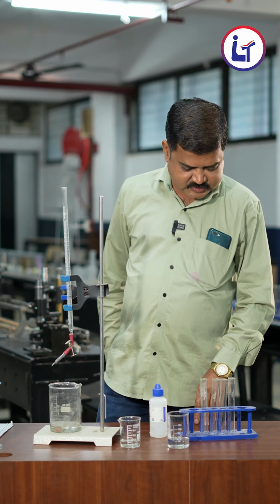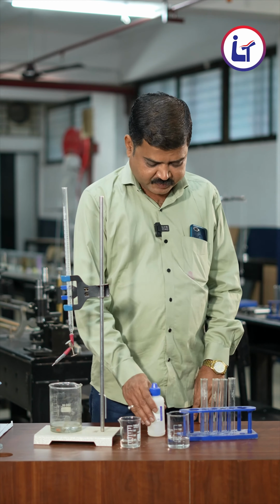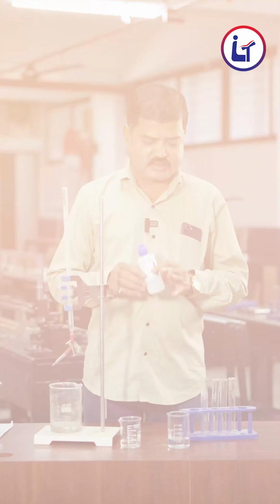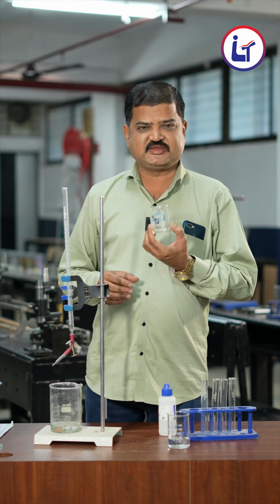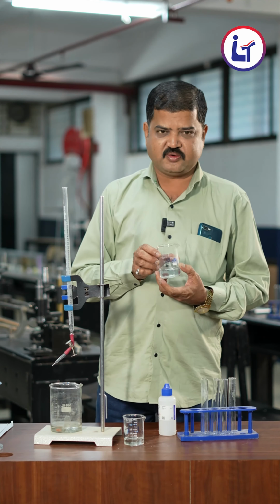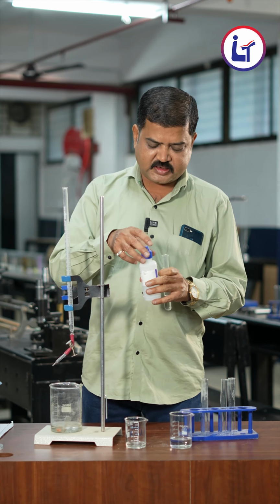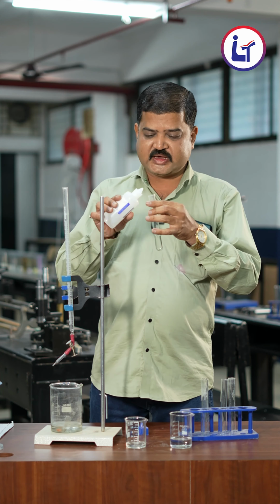Now students, we are studying the study of indicators, and I have here phenolphthalein indicator, which shows the color change in the acidic medium and basic medium. So I have an acid, for example here is HCl acid, and one base, that is NaOH. These are very simple bases and we check the color change. Why? Because chemical reactions are very important when they are visualized.